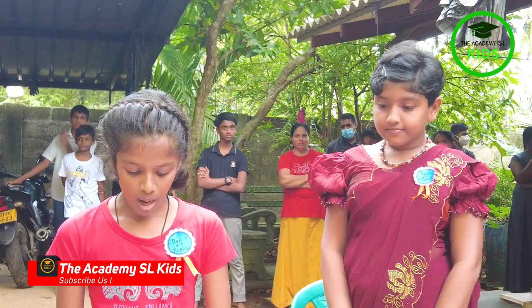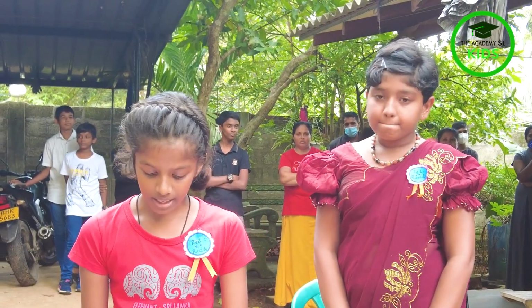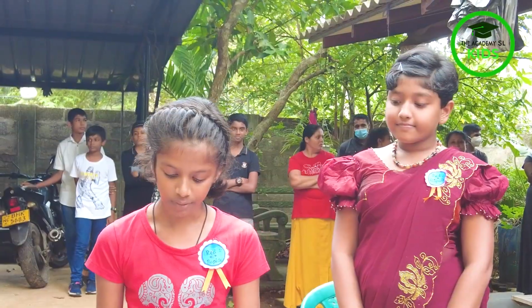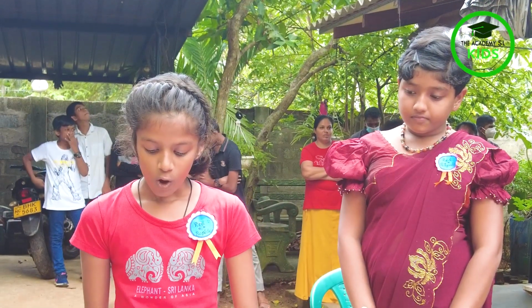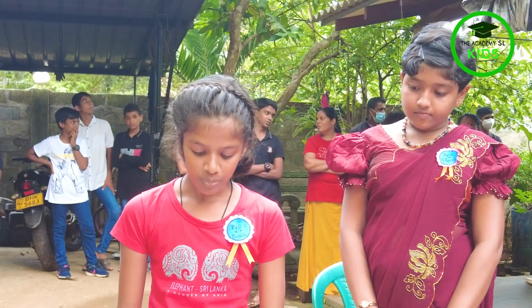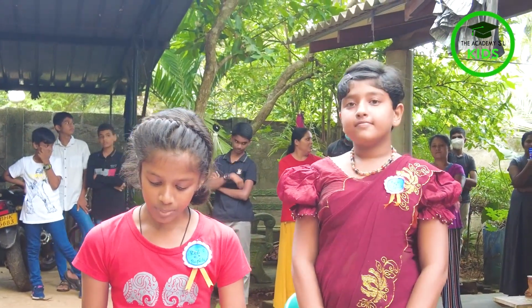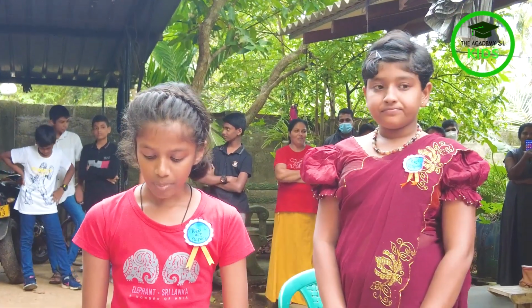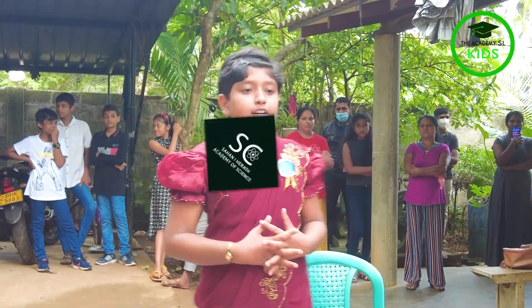Seventh, a sharp and clear image could be obtained by adjusting the middle and high power objective lens if necessary. Eighth, use the coarse adjustment to bring the low power objective lens upward after the observation. The last one is remove the specimen from the stage. Use a dry piece of cotton cloth to wipe the stage. Thank you. Very good.